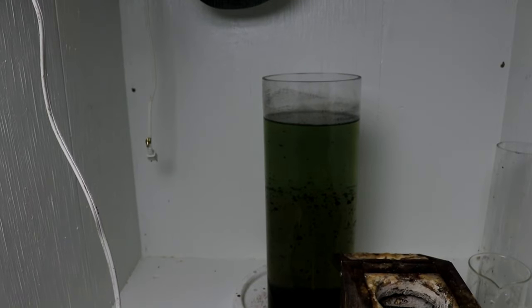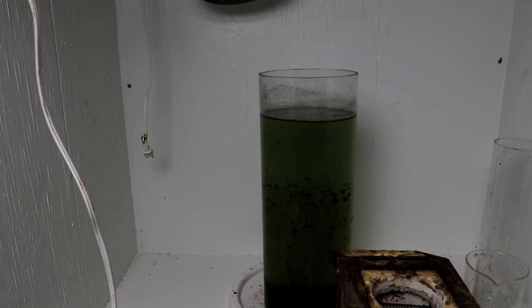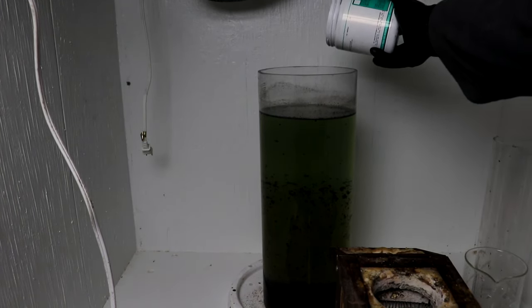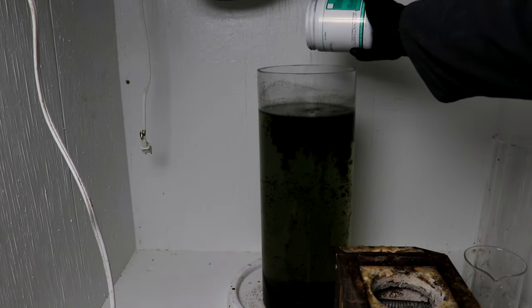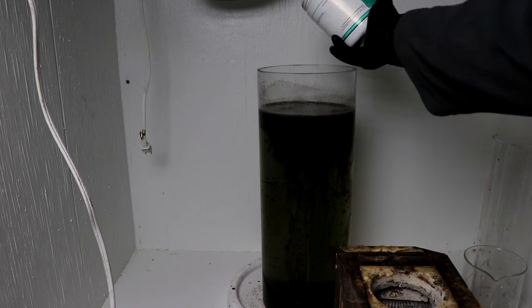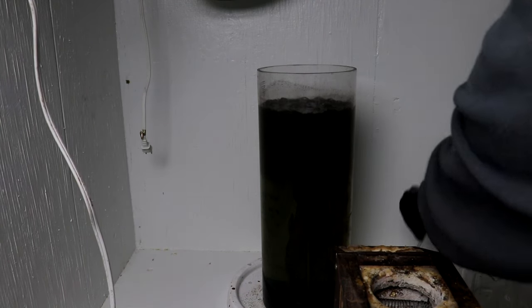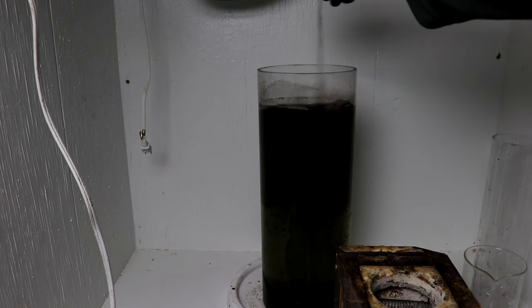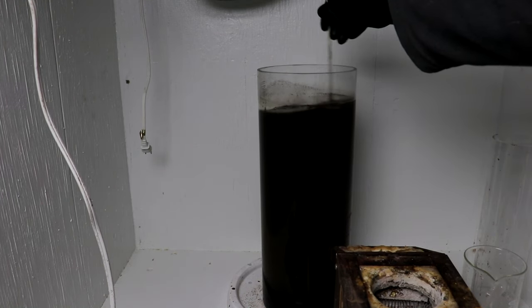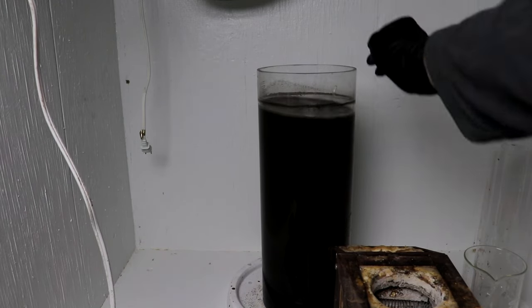Speaking of which, this cylinder in the back here is where I put all the wash water and the solution that didn't drop out. So it's got copper, but presumably a small amount of gold. Actually, it's probably quite a bit of gold. So I just put in some zinc powder, and that'll help precipitate the rest of the gold.